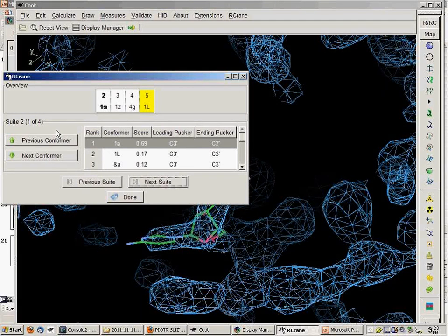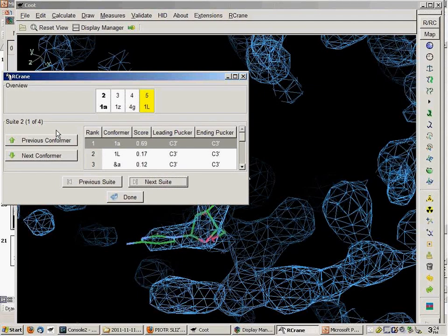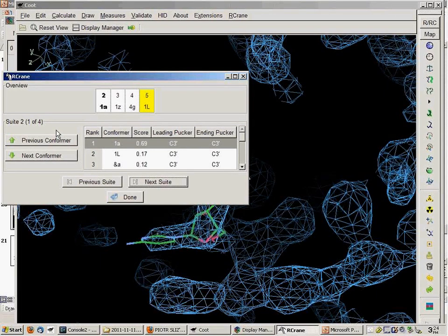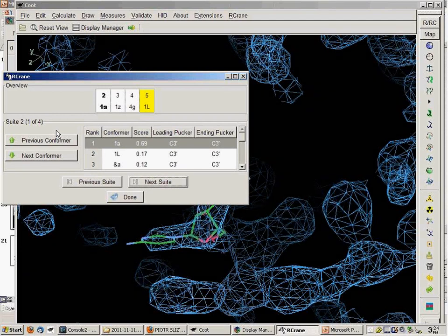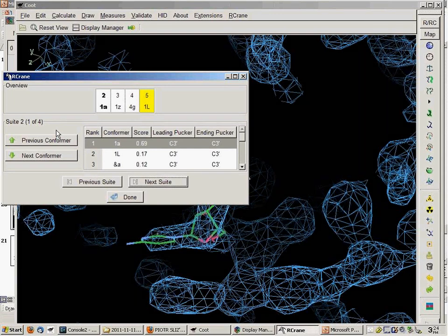And if this is now partially built, and let's say you want to go and tweak one of the bases, can you easily rerun the refinement in RCrane? So I can show you later how you'd go about re-running. Right now, once it's built, there's no way to go back and directly change phosphate and base coordinates while it's building. You can go later and fix things. What you can do is tweak the backbone conformers, which, you can see the window popped up now. We'll let you do that.